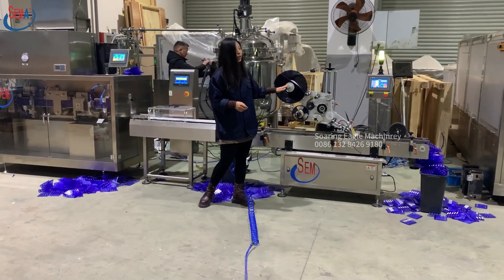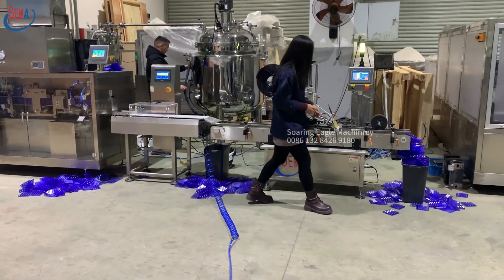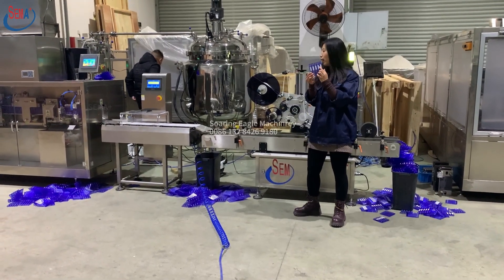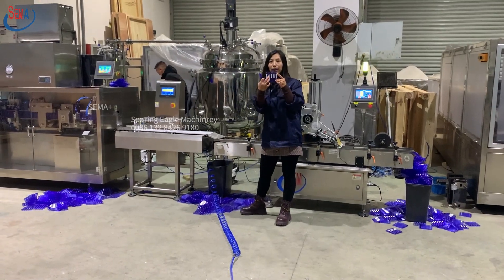And also this one — this is the labeling machine, to label the product. This is the label on it, and this is the timeline of the label.